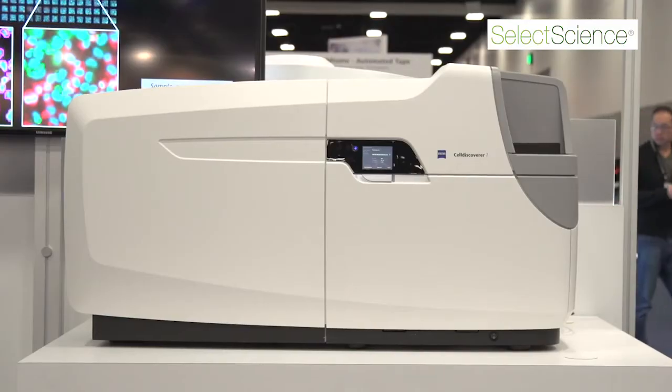I'm Scott Olenich, the Business Development Manager for Academia at Carl Zeiss. I'm going to tell you about the Cell Discoverer 7.